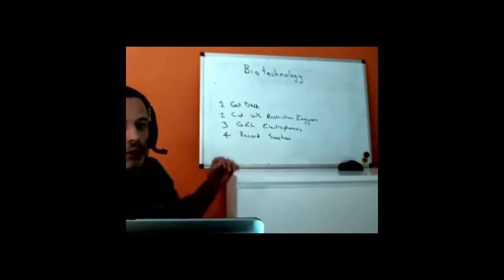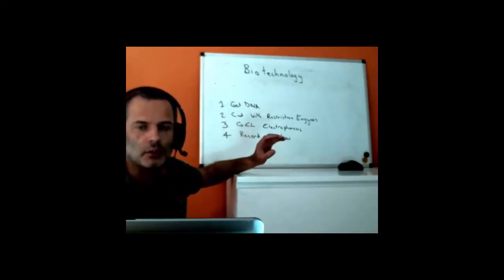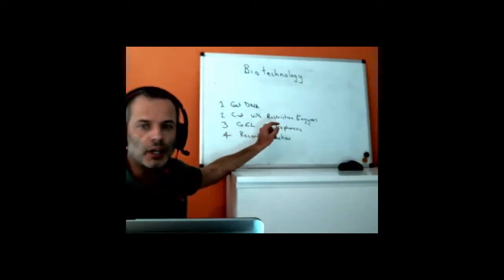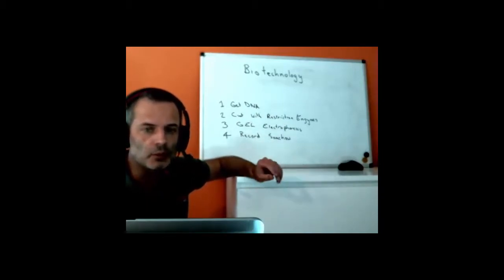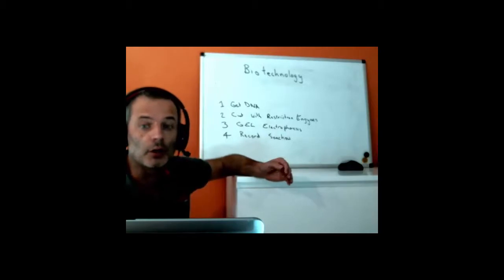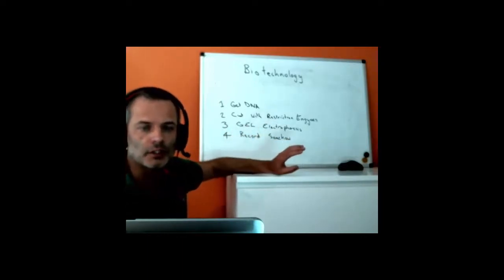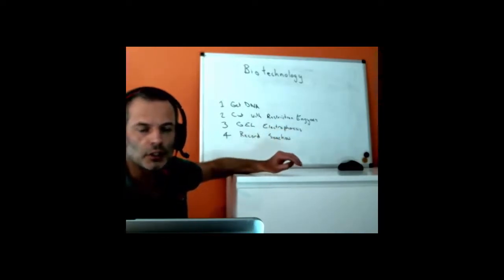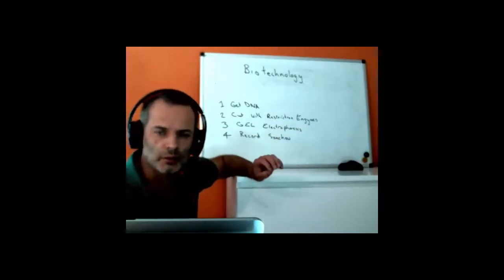So if we take the whole process, we have to extract DNA from the sample that contains a lot of other things, cut it up with restriction enzymes. So I've given you the name now, restriction enzymes. That is the type of enzyme that cuts up DNA, usually bacterial ones, because bacteria also have to protect themselves against viral attack. Then we carry out a gel electrophoresis, which is the name for that technique. Electrophoresis means we are moving things under electrical charge. Gel is the gel, and then we need to record it somehow, which we haven't talked about.